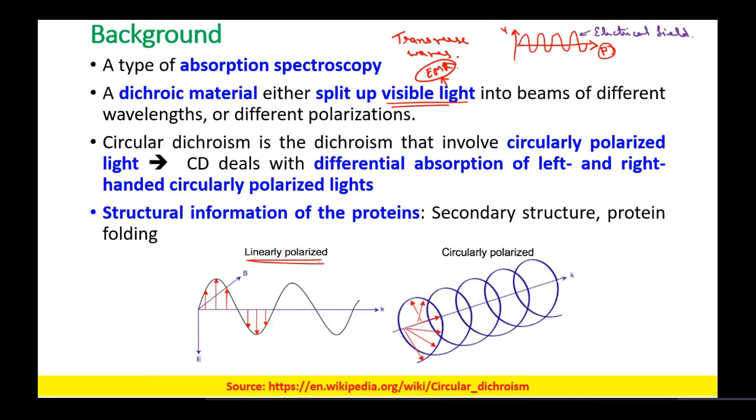It is also associated with a magnetic field, which is perpendicular to this electrical field. Accordingly, we say that the electromagnetic fields or the visible light waves are transverse waves.